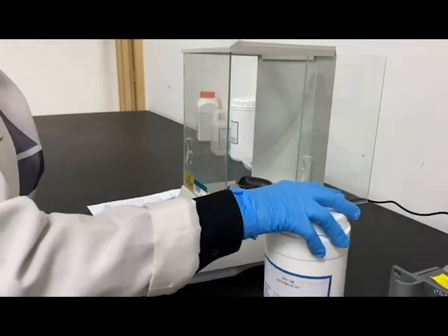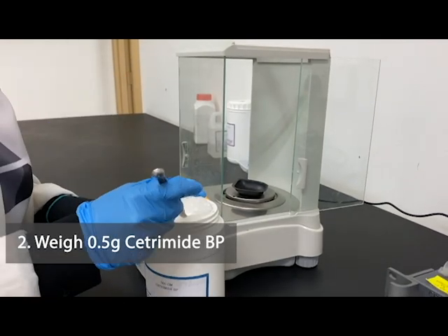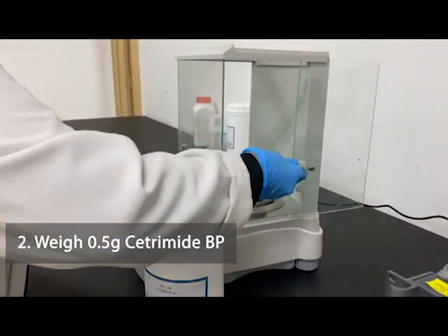As you're going to prepare Cetrimide cream of 0.5% weight over weight, you need 0.5 gram of Cetrimide BP powder.